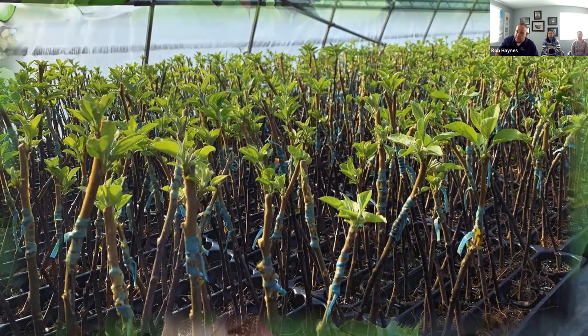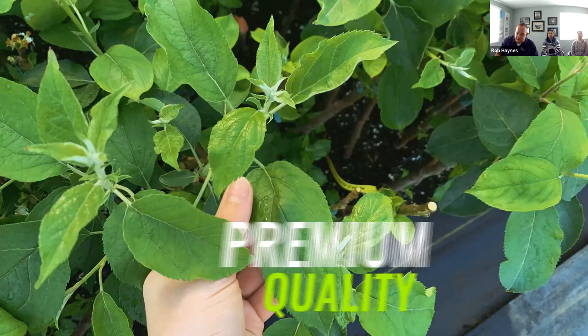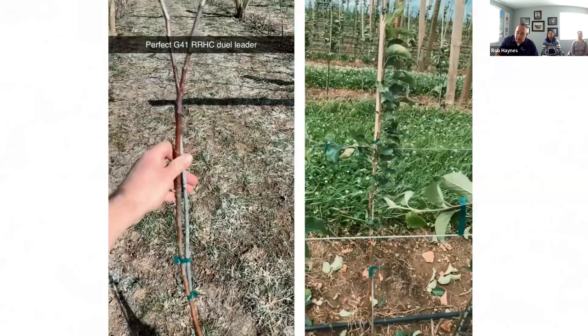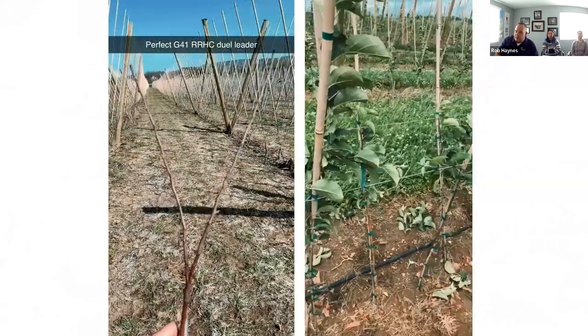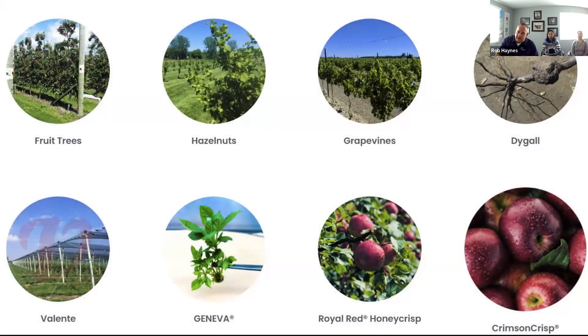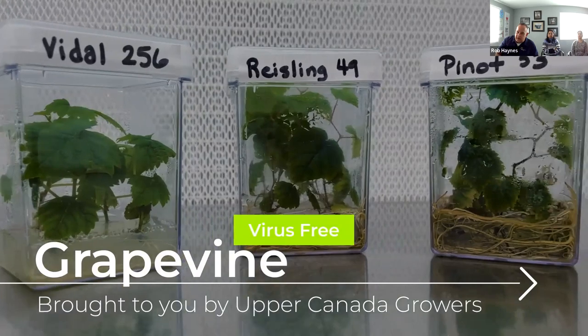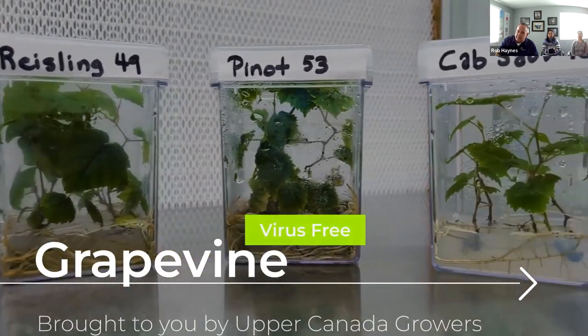We generally have been running in the 90% success rate at that point. So that's been actually really good. Now with apples, we learned how to micrograft. Micrografting isn't something necessarily new in the industry, it's been there, but we developed a lot of hormones with the university to heal that grafting.